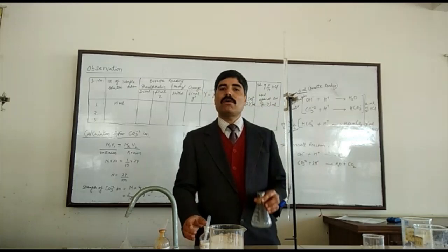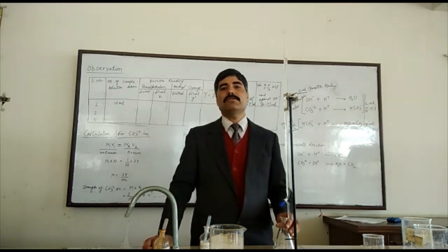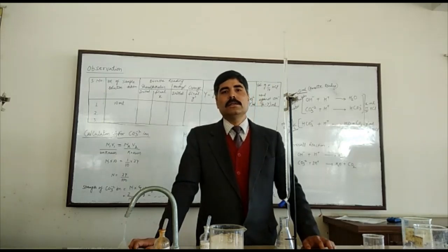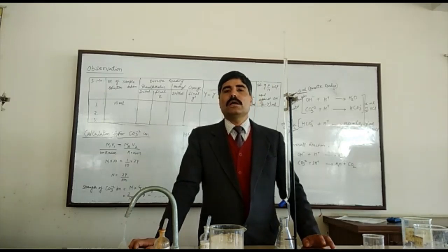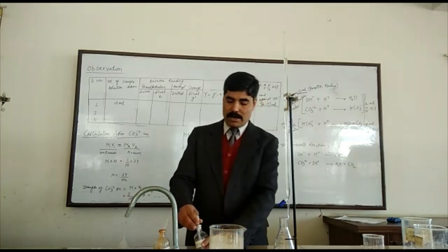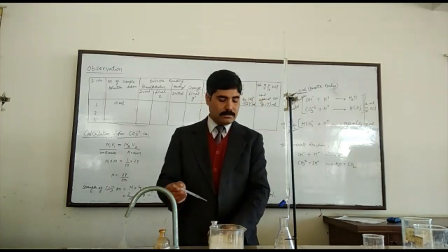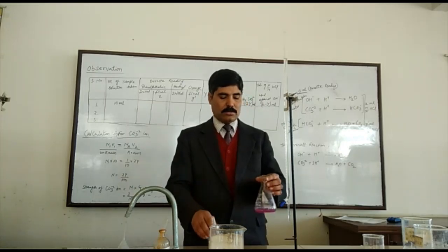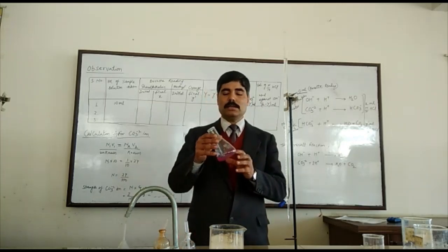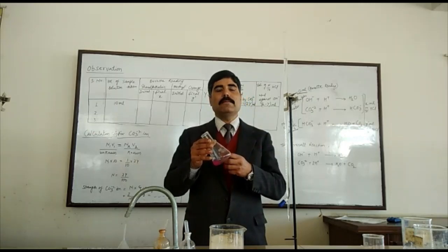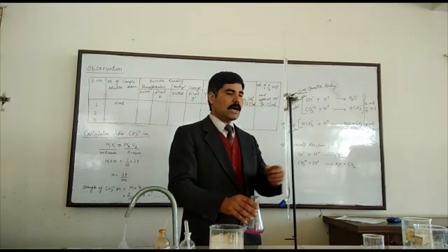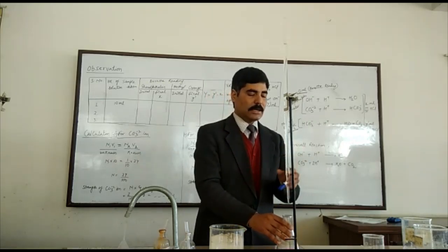First we add the phenolphthalein indicator to the given sample solution which contains carbonate and hydroxyl ions. Why do we use phenolphthalein indicator first? Because phenolphthalein works at a high pH range. As we add this phenolphthalein into the conical flask, a pink color appears. The pink color shows that phenolphthalein is in a basic region.